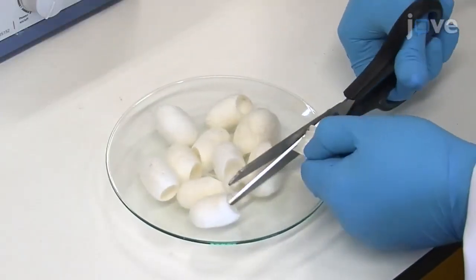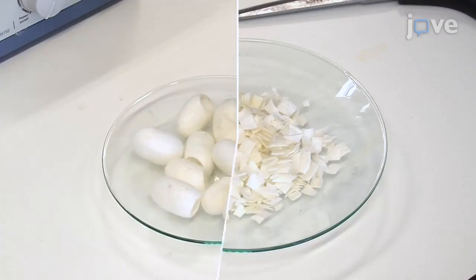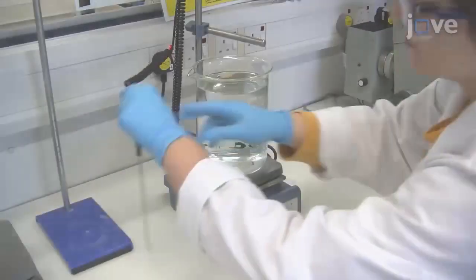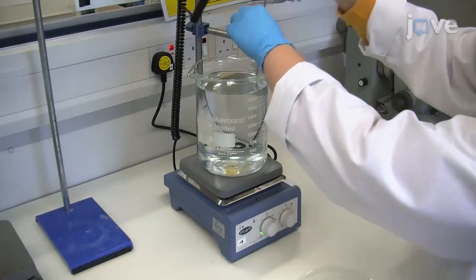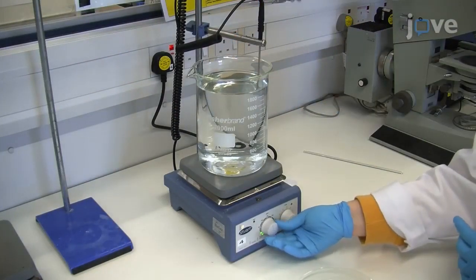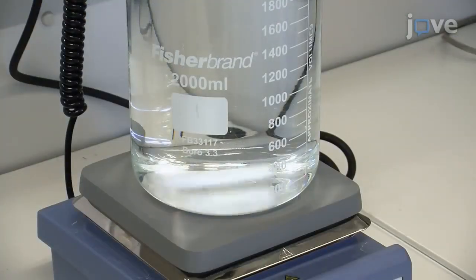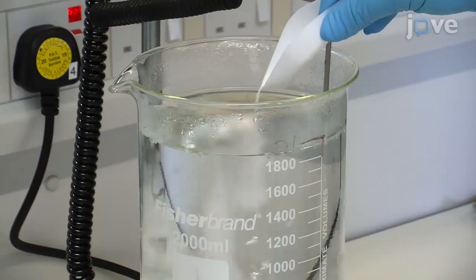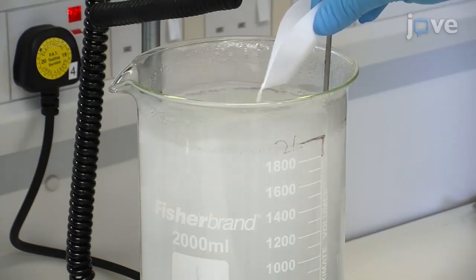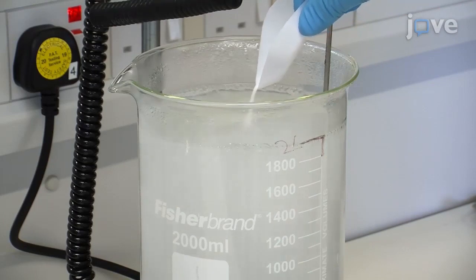First, cut 5 grams of clean silk cocoons into 1 centimeter squared small pieces using scissors. In an extraction hood, boil 2 liters of deionized water in a 2-liter beaker on a magnetic hot plate. Add a magnetic stir bar to the beaker of deionized water, then slowly add 4.24 grams of sodium carbonate to the water to avoid boiling over and allow it to dissolve.